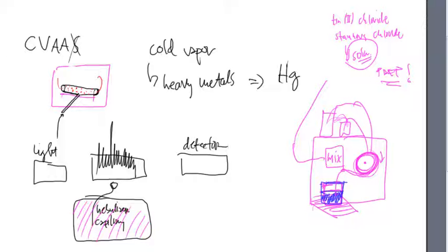What would happen is that the mercury would be sealed off and closed, and the mercury atoms would continue to get more and more concentrated here, and that defeats the purpose, because you're trying to measure how much mercury is in the sample. Unless you allow it to flow in and out in a steady stream, you'll have nothing to compare it to. The only thing you're doing is making that closed container more concentrated as time goes on. If you ran it initially, and then 5 minutes later, or 3 minutes later, or 1 minute later, you're going to get a different absorbance value because of that.